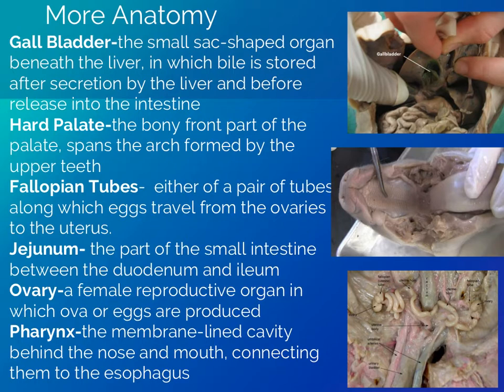Down here we have the female reproductive system. We have the ovaries, these little bean-shaped things on the end, and then this squirrely business that kind of looks like ramen noodles. This is the fallopian tubes or oviducts. Then they'll empty into the uterus, so that pocket right there is the uterus. In this picture I can also see the bladder, and I can see the umbilical arteries.